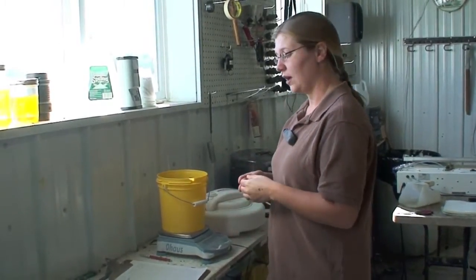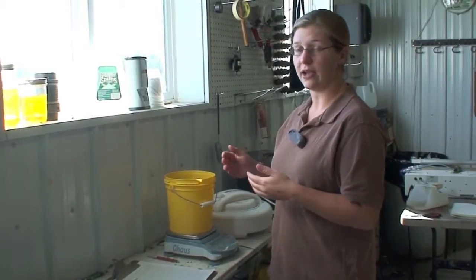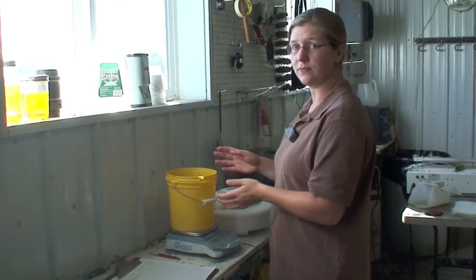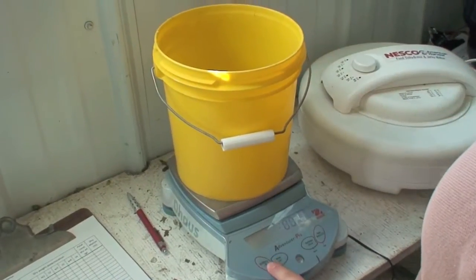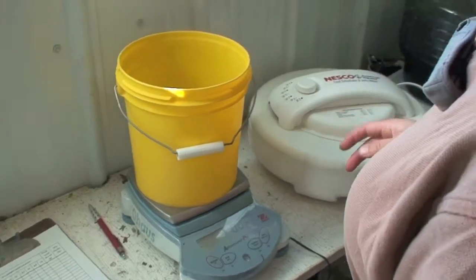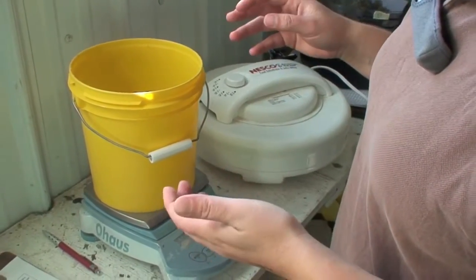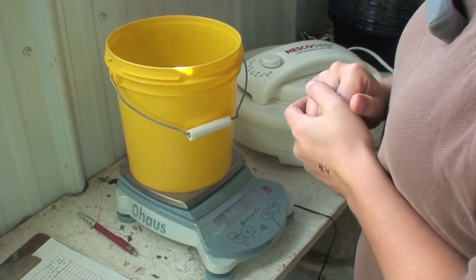You want to be sure that you have a fairly precise scale — ours goes to tenths of a gram. You either want to tare out the weight of the bucket you're using, or write down the weight of your bucket. We've zeroed out the scale so that it weighs zero with the bucket on there.